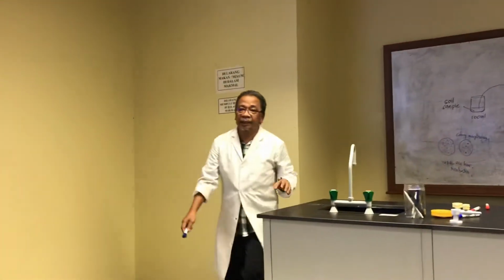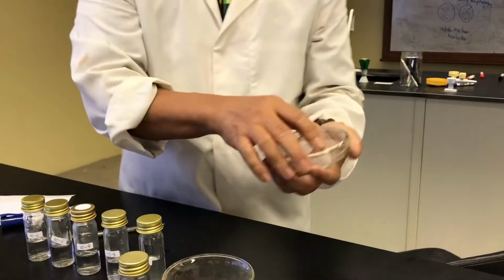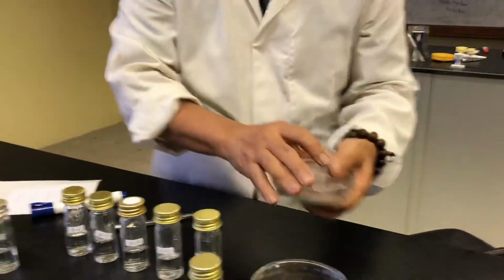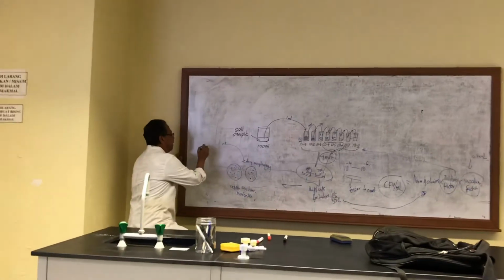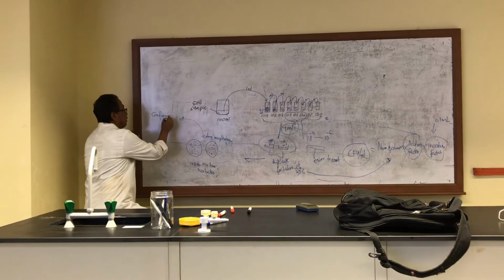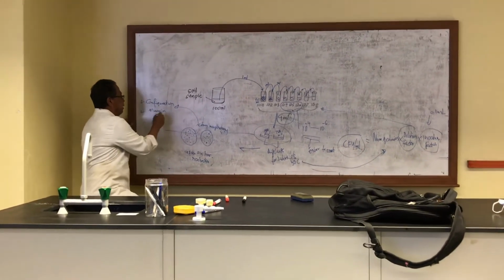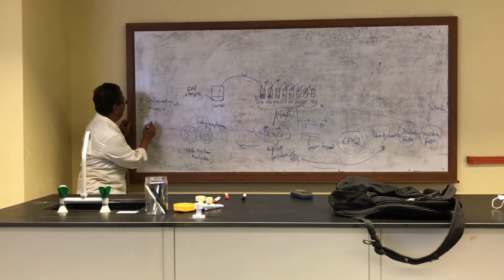So usually this is not a disposable plate. Let's say you have agar there, and when you open it in the laminar flow, there can be a lot of growth. In your assignment, I've given you the colony morphology, so try to describe them. We have the configuration, and then you have the margin, and then you have the elevation.